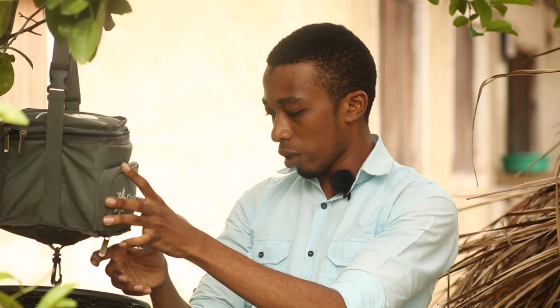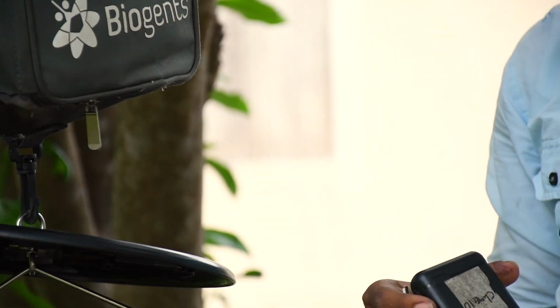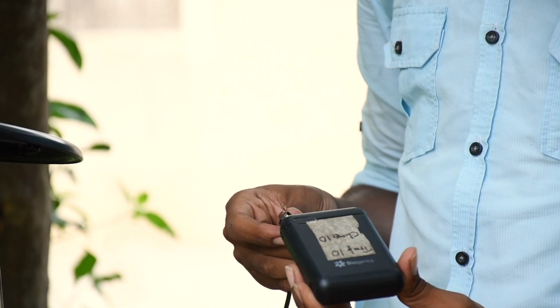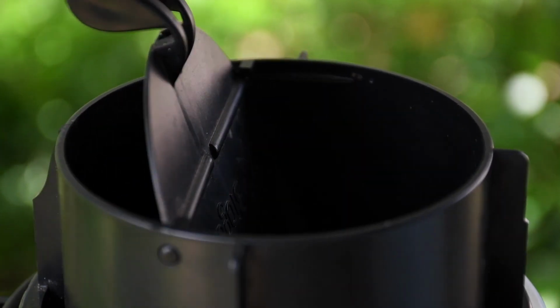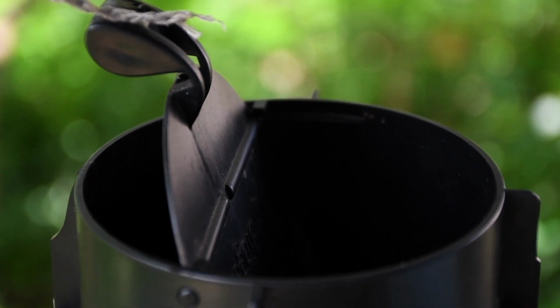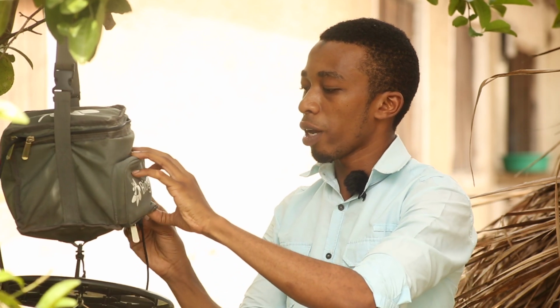Now, the BG trap is set operational by connecting the trap to the battery, which is stored in the battery compartment. So this right here is the battery. It looks like an ordinary power bank. Now once we connect it, you will notice that the trap door automatically opens, and then there's a whirring sound coming from the motor that is inside the trap. So we store the battery inside the battery compartment.